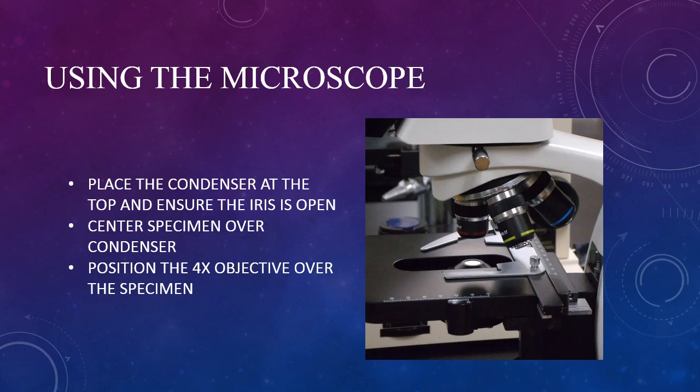The condenser's height is controlled by a small knob at the back of and below the stage. Using the stage controls, center the specimen over the condenser — that's the specimen, not the slide.